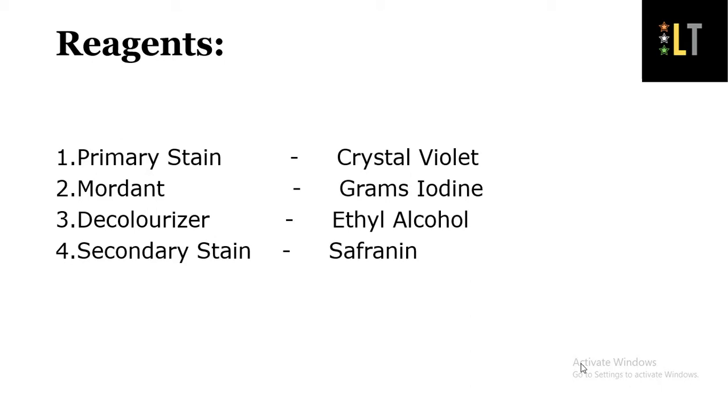The reagents required will be the primary stain, that is crystal violet, the mordant, that is gram iodine solution, the decolorizer, that is ethyl alcohol, and the secondary stain, that is safranin.